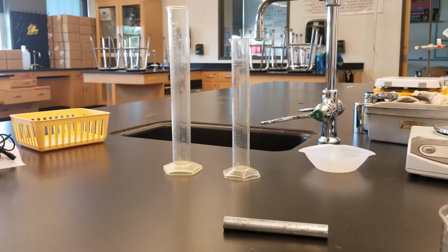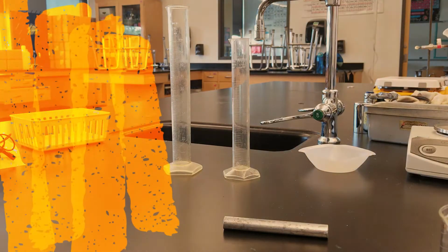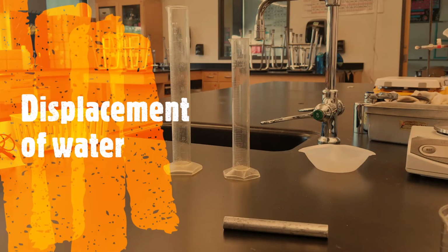In part 2, we are going to measure the volume of each of the 5 objects by using the displacement of water. Take a 50 milliliter graduated cylinder, fill it up to 25 milliliters.